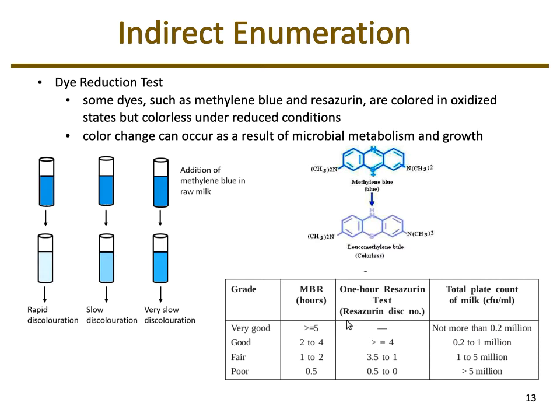So like the most probable number, with the dye reduction test there's this back calculation of total plate counts, the CFUs per ml, but the reality is it's, again, a little bit more qualitative, saying whether organisms are present or not.